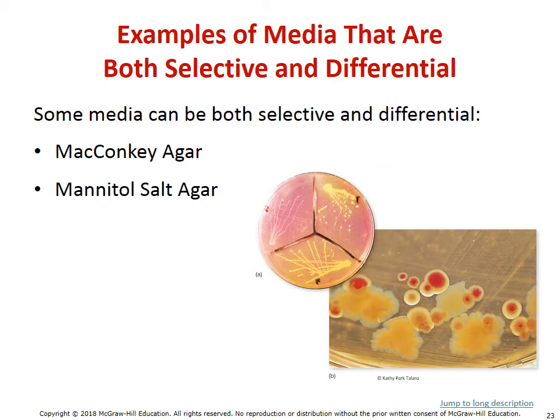And so the idea here is if you see growth on a mannitol salt agar plate or an MSA plate, you know that the organism is at least salt tolerant, meaning that it can survive in the salt. But again, if we have the ability to break down mannitol and turn it into an acid, notice that there's a color change here. That color change is the accumulation of acid that is affecting the normally pinkish red phenol red. And so whenever the pH changes, that red turns to yellow. So this is illustrating that this is an acid environment, meaning that we're breaking down that mannitol.